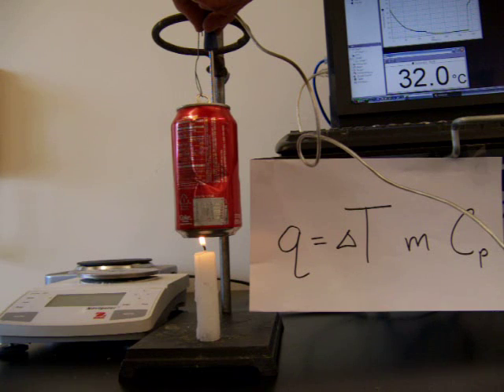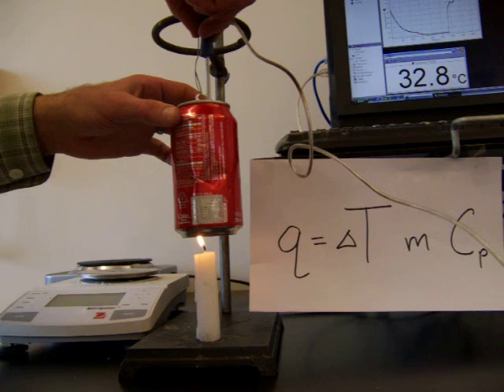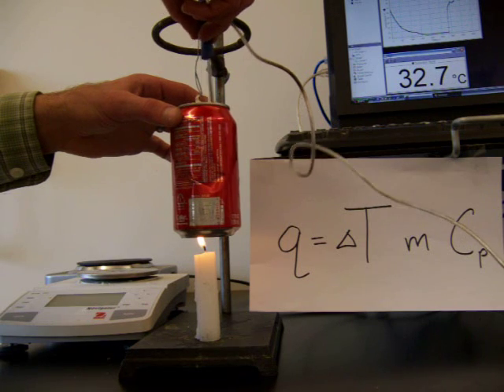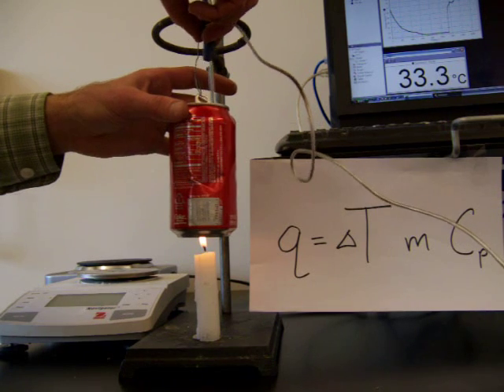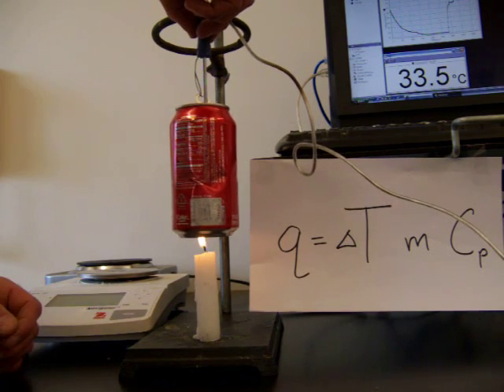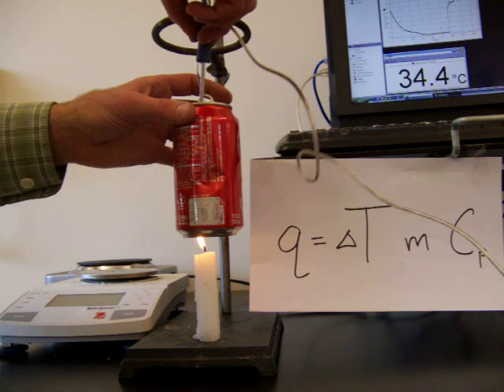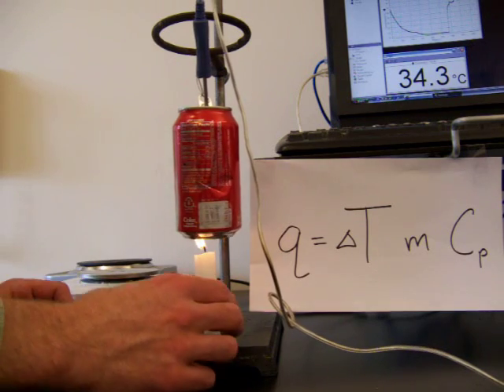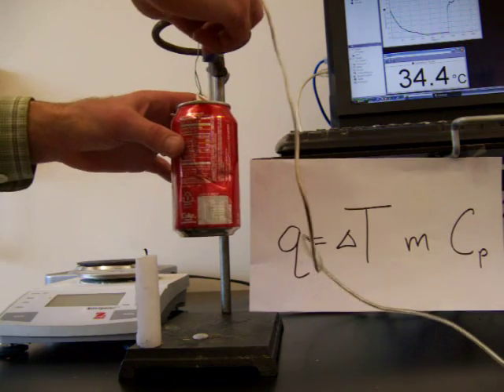We'll let it burn for about one more minute and then we'll get our final temperature reading. Okay, so 33.6, looks like it's going to be, we're getting a little hotter again. Let's stir it. Let's extinguish the candle and then we'll look for a final temperature. So we'll carefully blow out the candle and then we'll stir this around and get a final temperature.